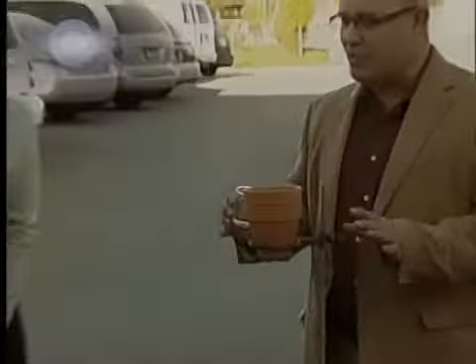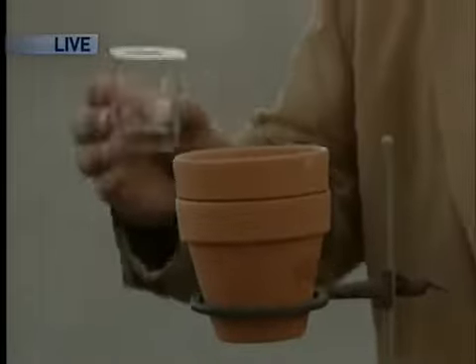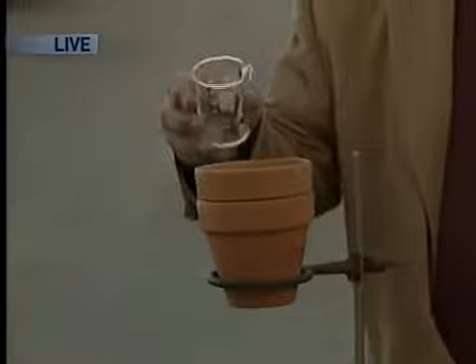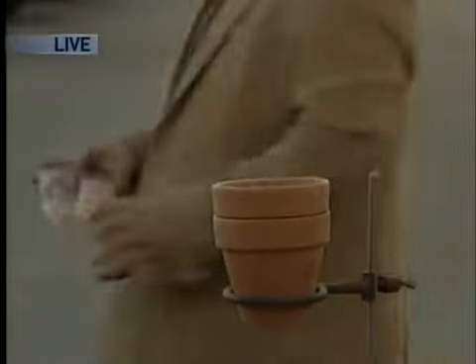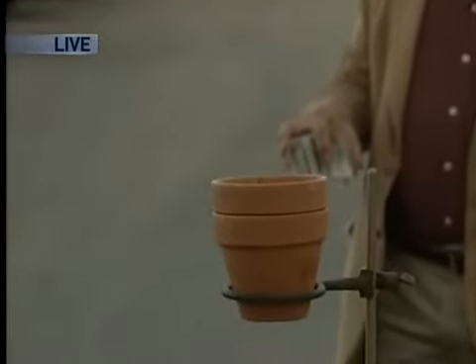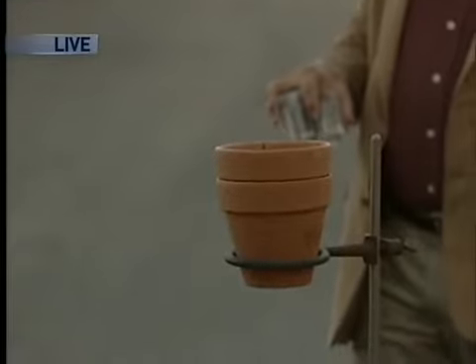So we want to step back after I do this. Join me over here. One of the reasons why I do this is because it gives us a little bit of time, and they tell me never to look inside this while I'm doing this. So anyway, we're going to add the glycerin. You're going to see a little puff of smoke as the permanganate and the glycerin react, and then the reaction should take place. I brought it back up just in case. It's a little cold, so the reaction is going to be a little slower, but soon.